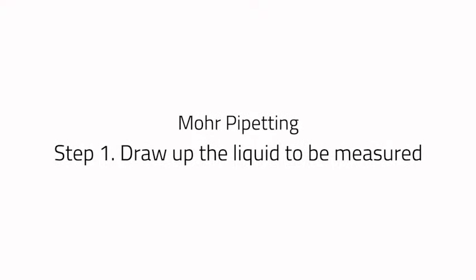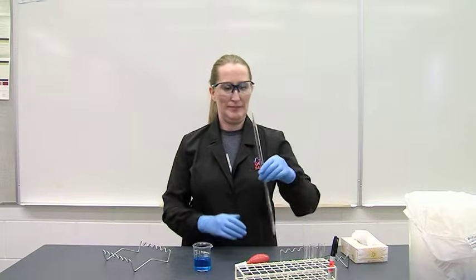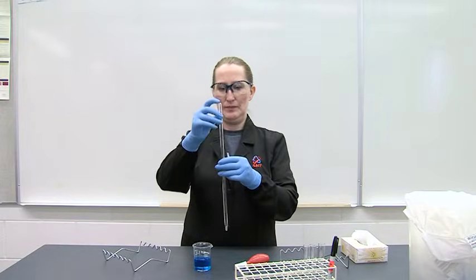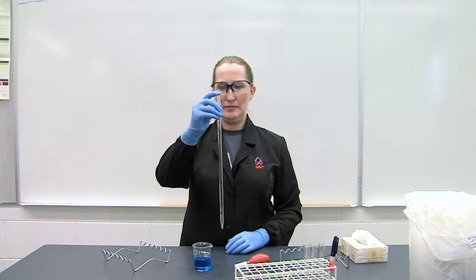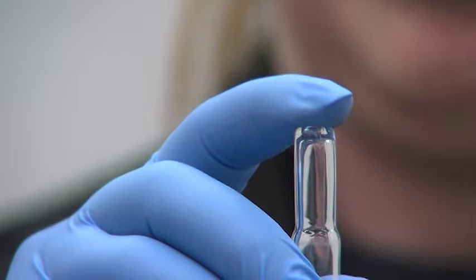Step 1. Draw up the liquid to be measured. Hold the stem of the pipette between the thumb and the middle fingers of your dominant hand. Allow for the movement of the index finger on and off the top of the stem.